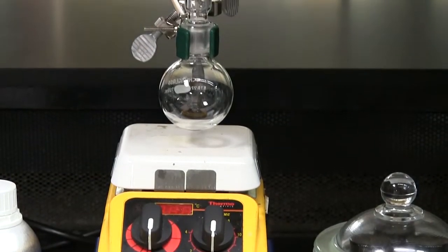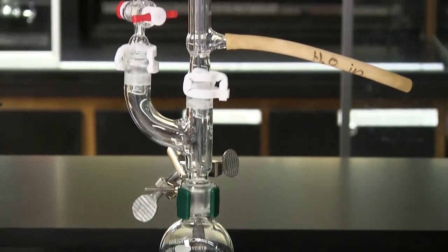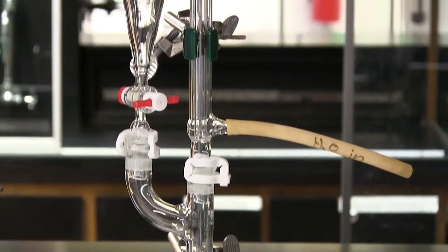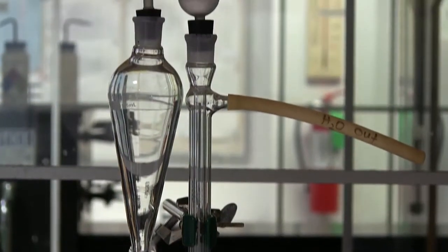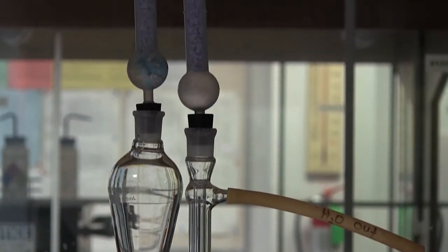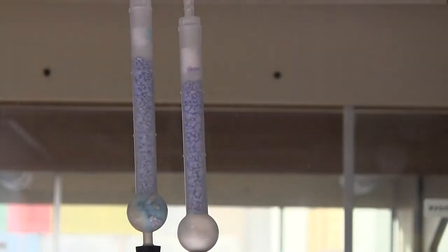Set up an apparatus for addition and reflux as shown in the lab book. Obtain the glassware for this setup from the oven where it has been drying for several hours. Assemble as soon as it is cool enough to touch. Work quickly and efficiently. It is important to assemble the apparatus before moisture from the air condenses inside the glassware.